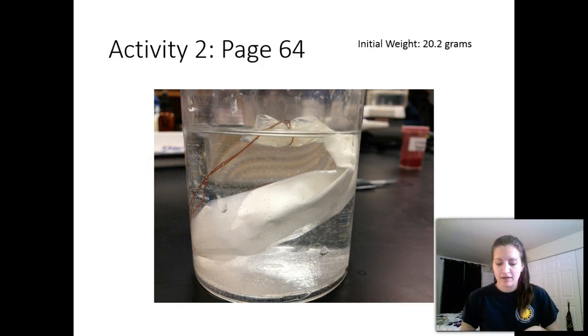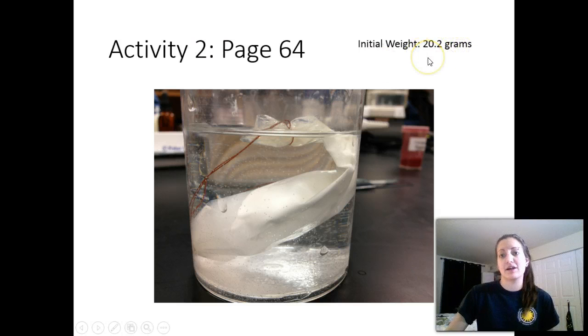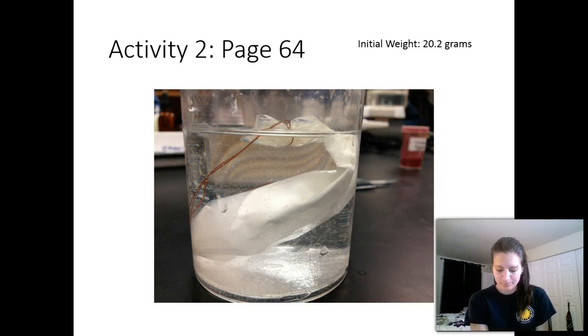So go ahead and look at number 5 on page 65, and it asks you what the initial weight is. And so this is one from my other class, and this weighed 20.2 grams. You can see that here. So go ahead and write that in that blank.